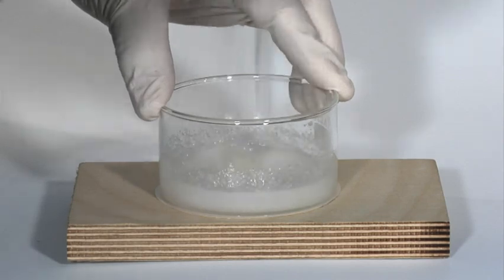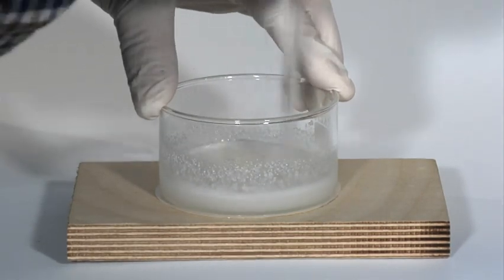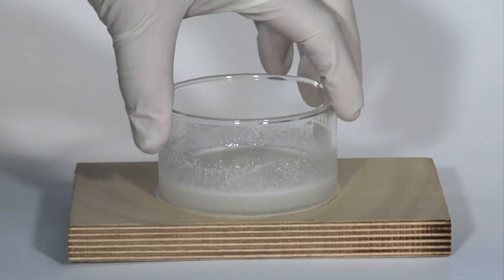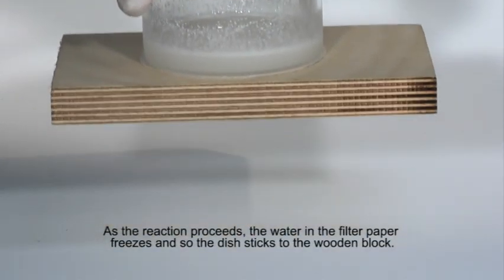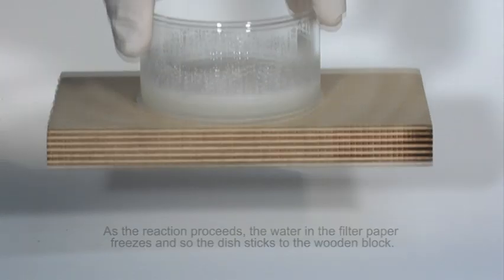The temperature drop is approximately 35 degrees Celsius and sufficient energy is transferred from the wet filter paper to the dish so that the water in the paper freezes and sticks the dish and wooden block together.